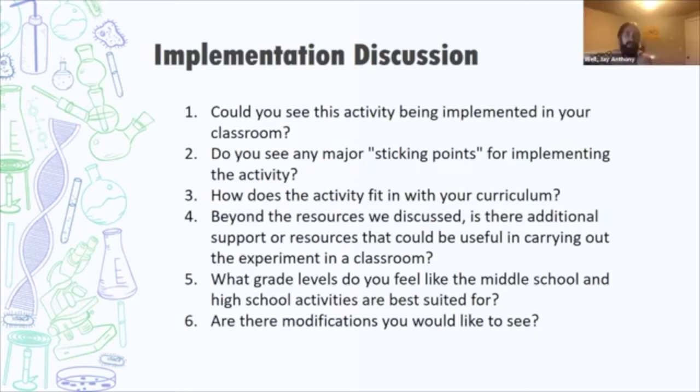Yeah, I think it really is something you can discuss with your class, because two things may happen. People may be calling germination different things, so that's one of the issues, and then what happens if you have germination and then that seed dies? So you have germination and then the next day you come back for your next data point and it's all dried up. Now, do I still count that as germination? Do I count that as death?